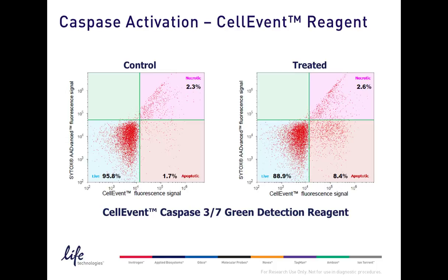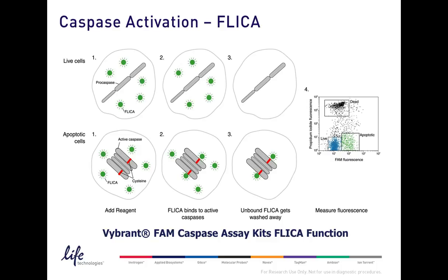And again, these just further highlight the need to include a dead cell dye in these experiments to get that multiparametric readout of apoptotic, late apoptotic and necrotic.